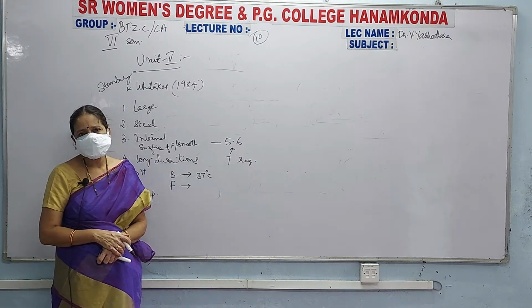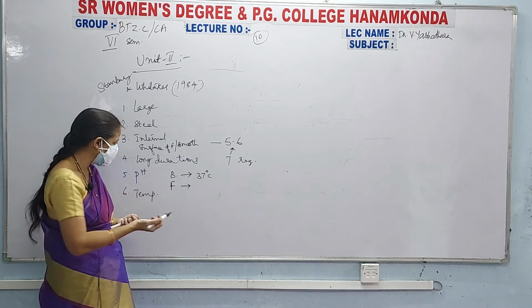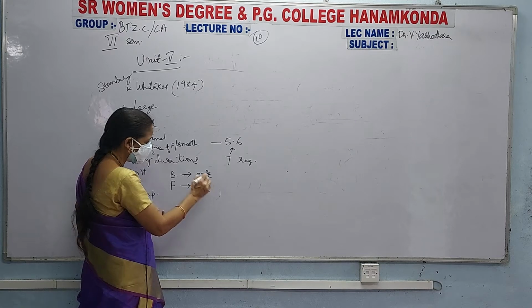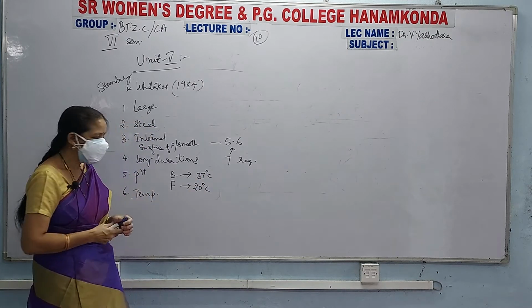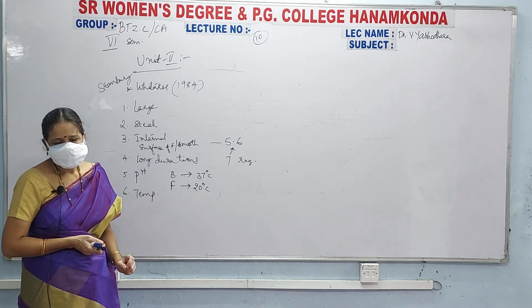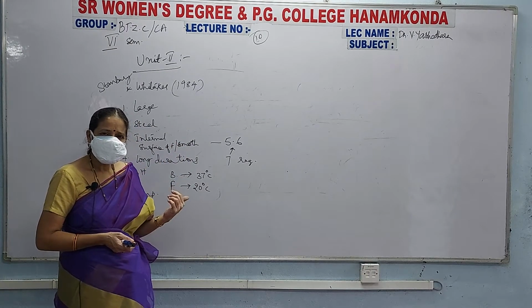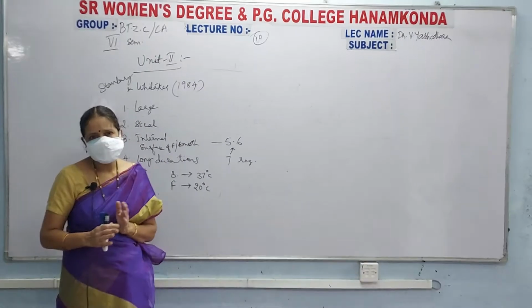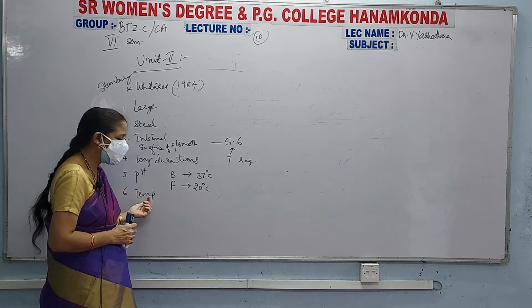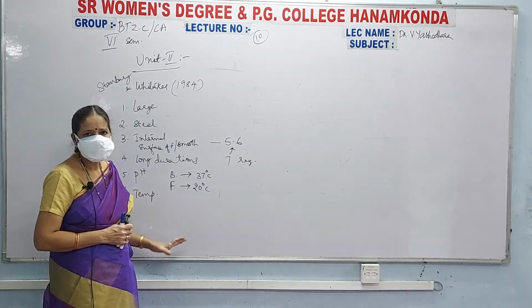Penicillium notatum or Penicillium chrysogenum or Streptomyces griseus, whatever it may be that you are using, then this fungus grows at 20 degrees centigrade. That means, based on the microorganism, the temperature of the fermenter should be maintained. If the temperature has increased or decreased, the microbial growth is restricted. For that reason the temperature checking and regulating device should be equipped with the bioreactor.